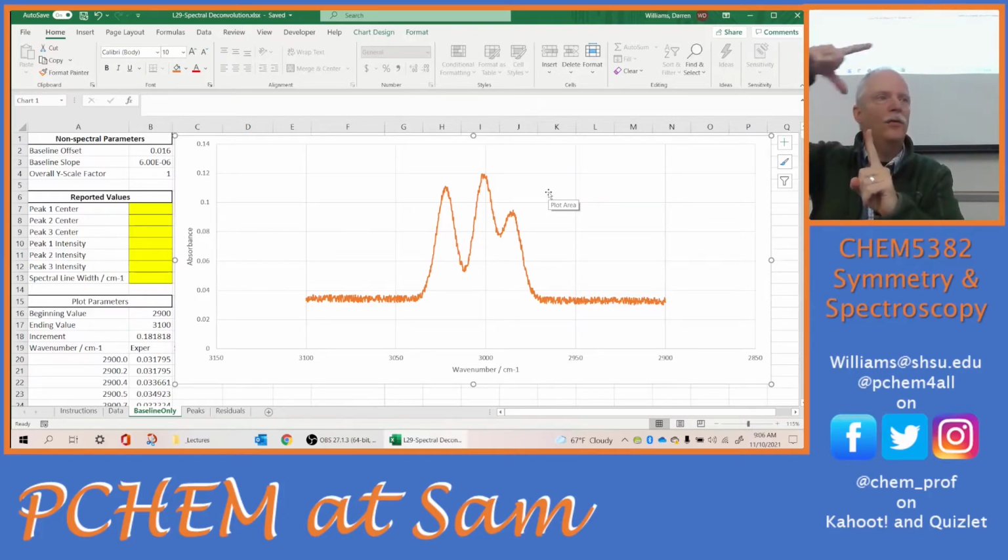So we take the stick, we put a Gaussian on it, and then we add up all our peaks. That's convolution. Deconvolution is doing that in reverse. We do it in reverse by simulating the spectrum and getting it to match. Then the peak positions that we used in matching the simulation are the peak centers of those peaks.